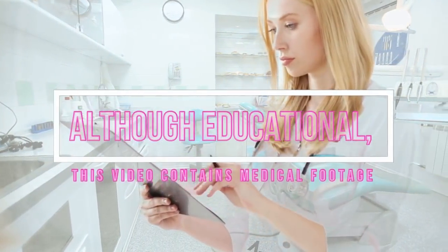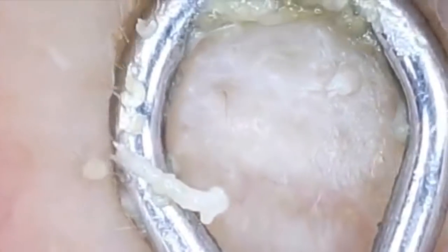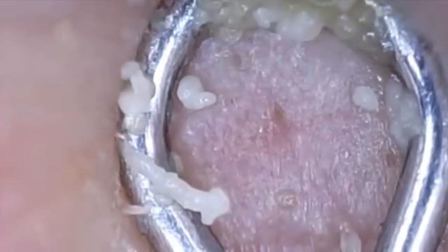We've all seen some unique microscope footage like this clip from Ultimate Popping, but today we're going to take a look at the most powerful USB microscope on the planet. So let's kick it off right about now.